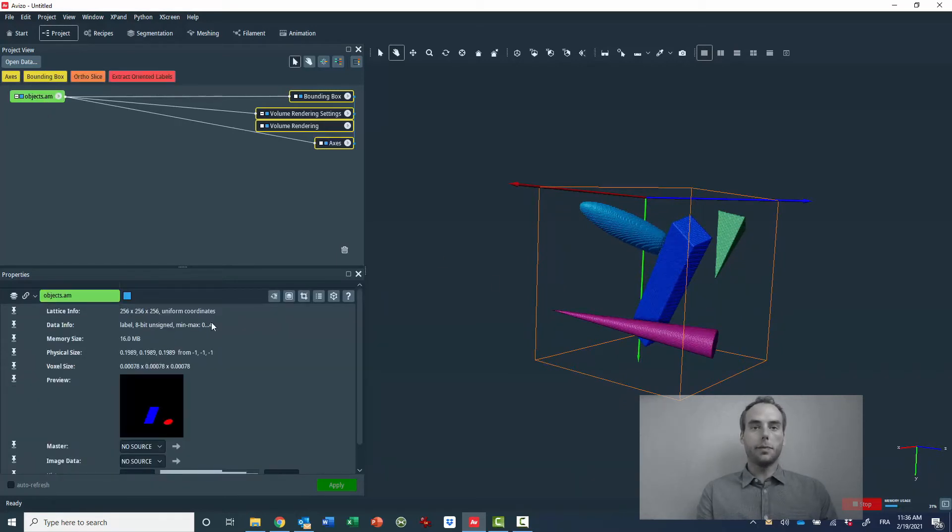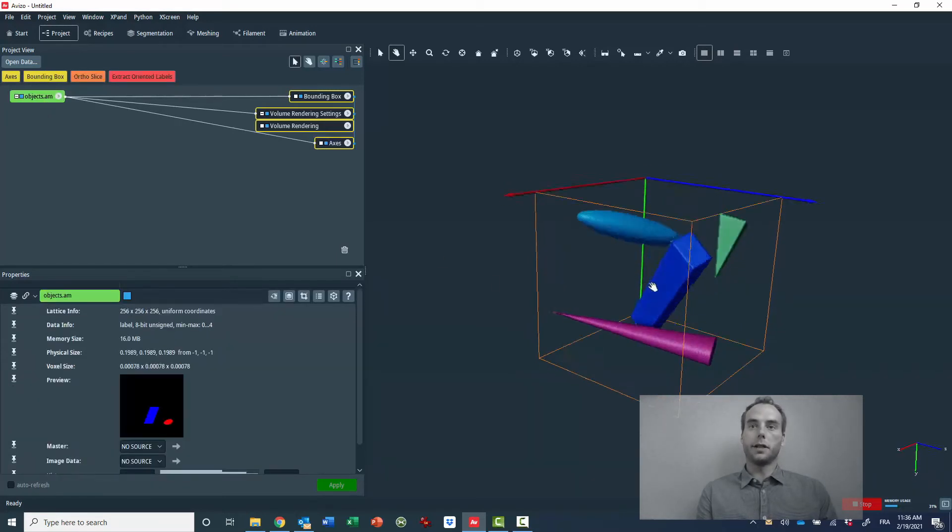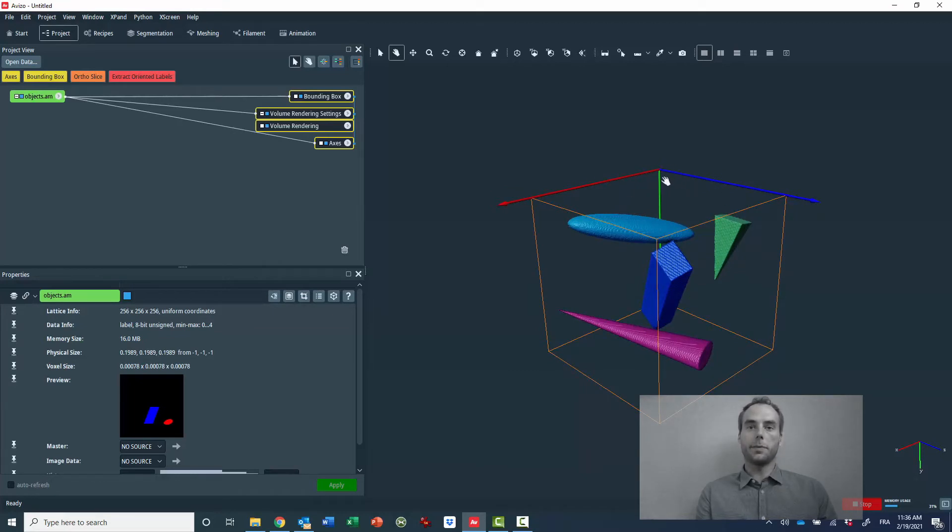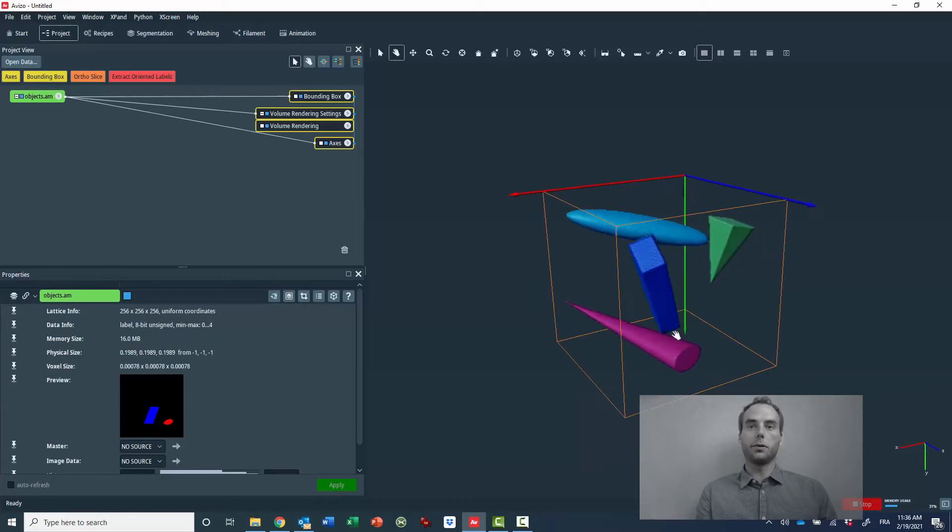I also display the local coordinate system, where the red, green and blue axis respectively correspond to the X, Y and Z axis.